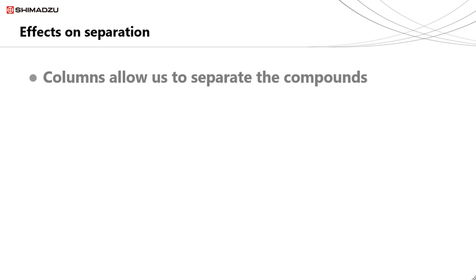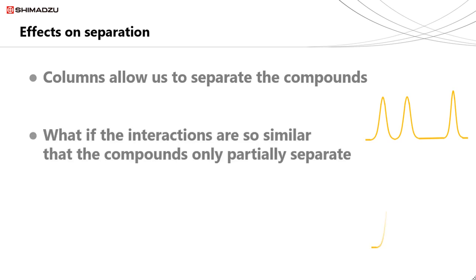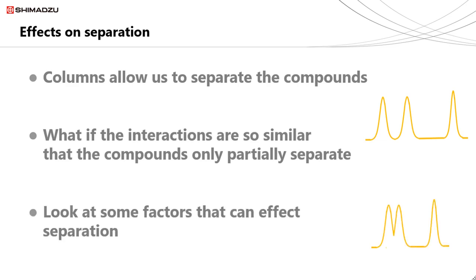So during session 1 and so far during today's session we have established how different techniques separate our mixtures. What happens if these interactions only partially separate our compounds? What other techniques can we use to change our partially separated compounds to fully separated?